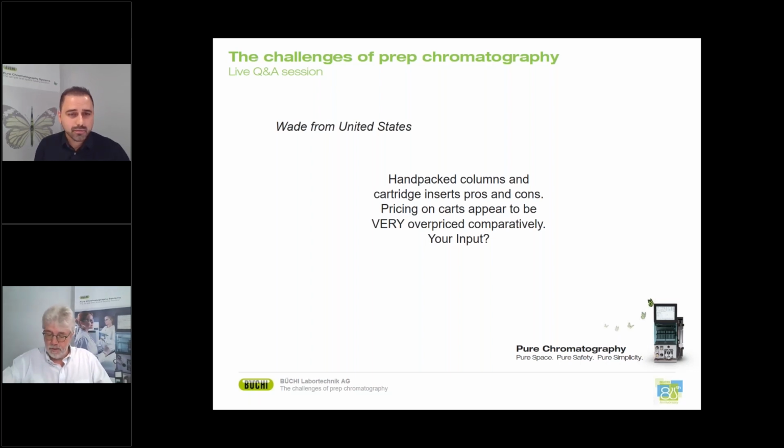So thank you, Bartosz from Poland, for your next question. It's the following. So how do you reduce the formation of channels in self-packed columns? That's an interesting one.